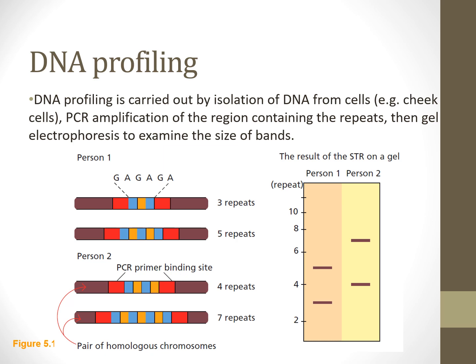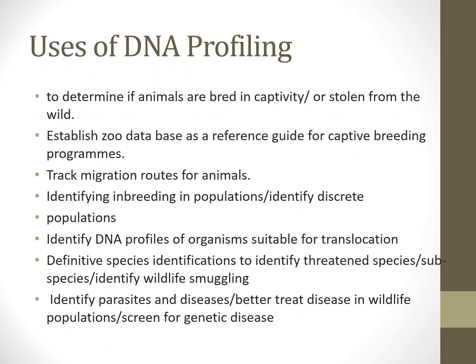Our restriction enzymes are basically molecular scissors. So they're designed to cut DNA at a particular marker point.